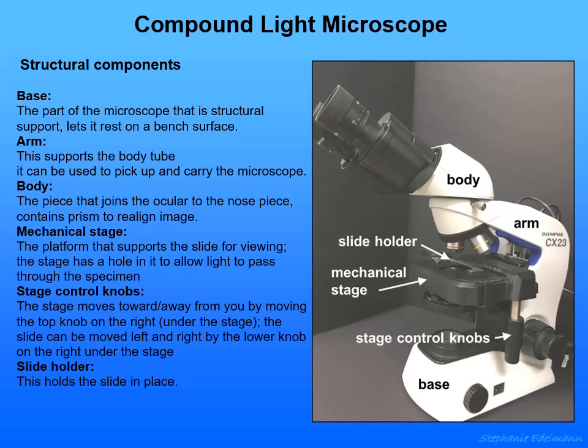When you're looking at a microscope, the thing that it stands on is called the base. Then the solid part that goes around the back is the arm. You use the arm when you carry a microscope. When you carry a microscope, you want to get a hold of it by the arm and put one hand under the base. You should always carry a microscope using two hands. The reason why you hold those two parts is because those are structural parts of the scope that are not mobile, which makes them useful to get a firm grip. Microscopes are heavy and expensive. Be careful when you handle them or carry them.